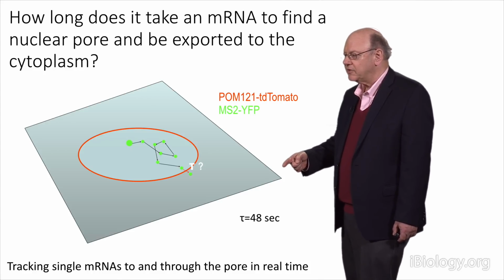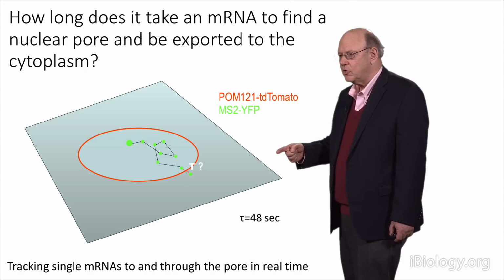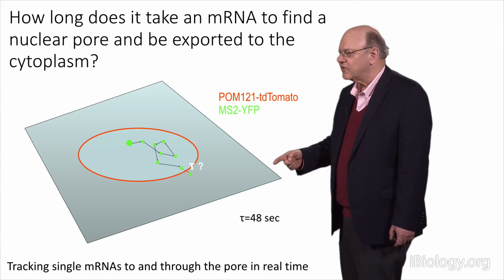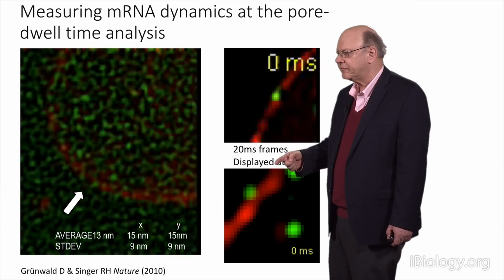Now, when it does that, something completely different happens, because the RNA goes from diffusion to a directed transport from one side of the pore to the other. And so how does this happen? And can we see this?